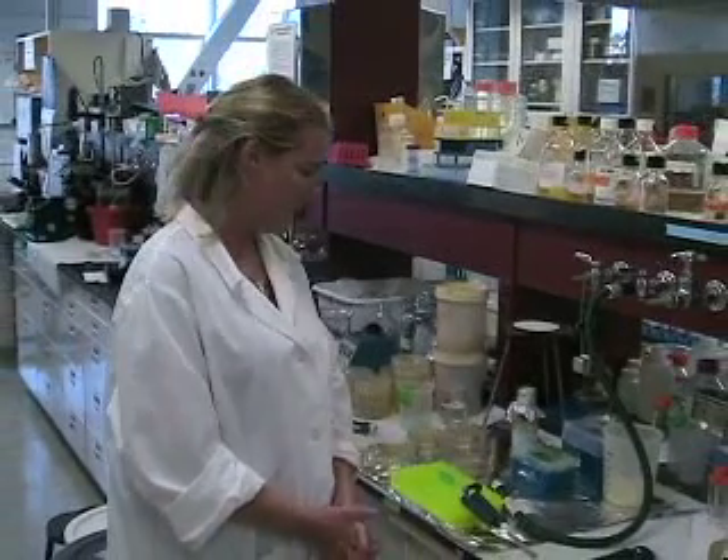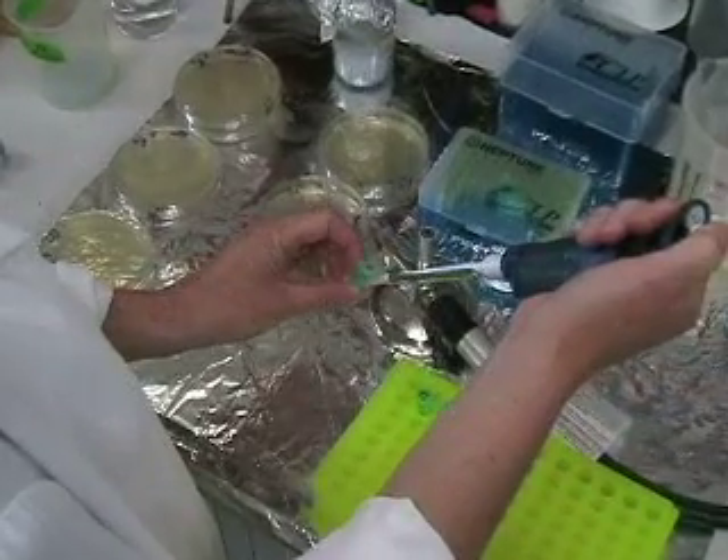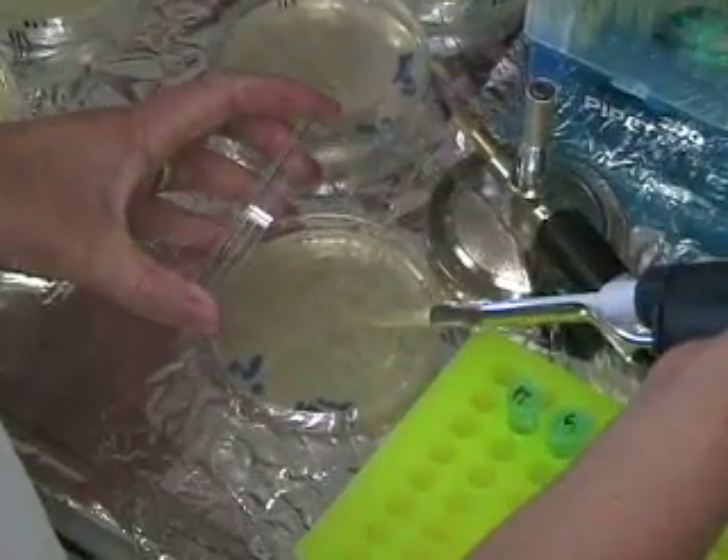Now we have finished the incubation at 37 degrees and we are going to plate the bacteria on LB plus antibiotics. In my case it's chloramphenicol. I pipette 50 microliters of each sample and put it on the plate.